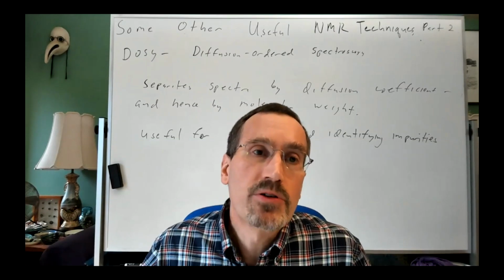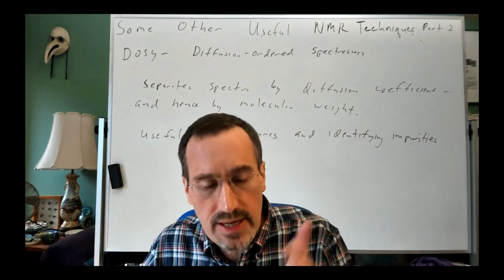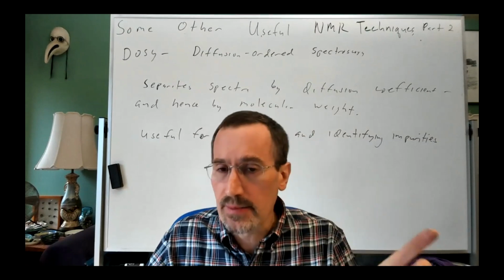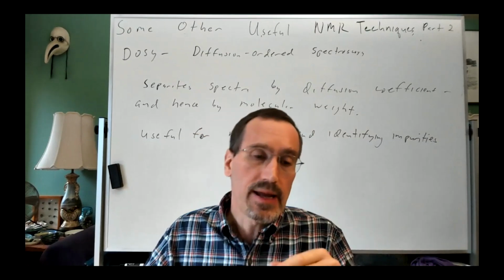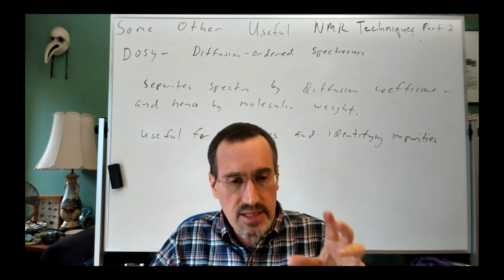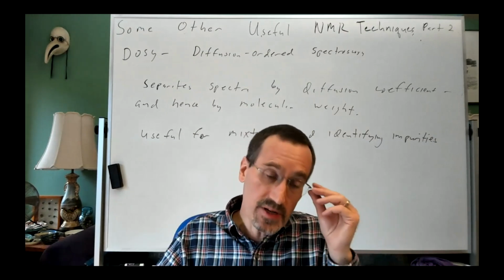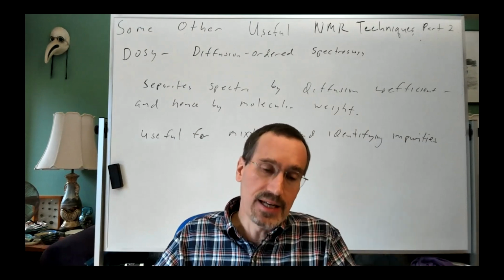So my laboratory uses this technique because when we're looking at our molecules, we'll have equilibria between monomer and dimer or tetramer. And so we're interested in identifying, what are the relative molecular weights of the species, or what is the oligomerization state? Is it a dimer?